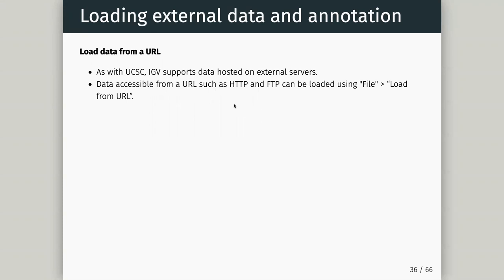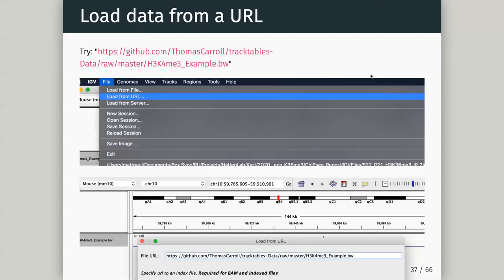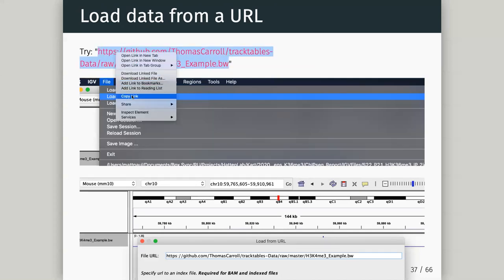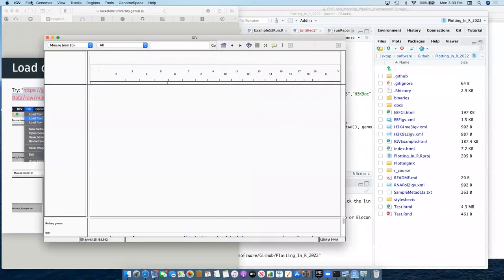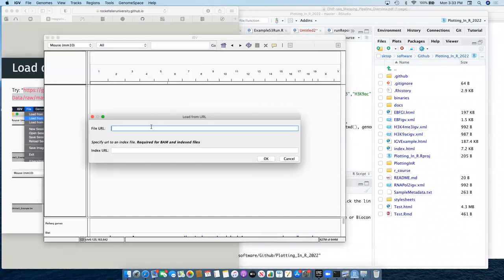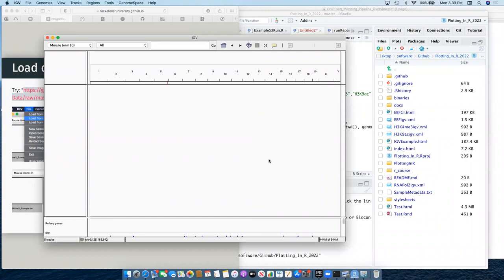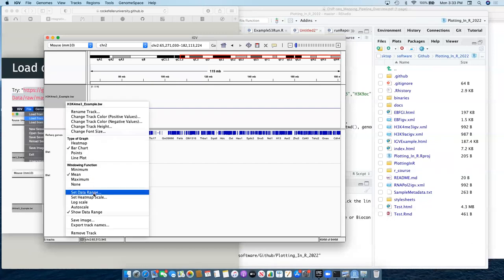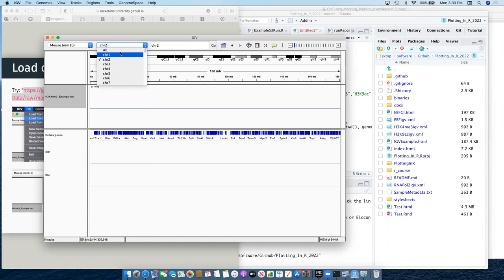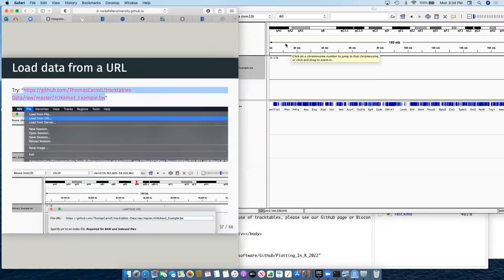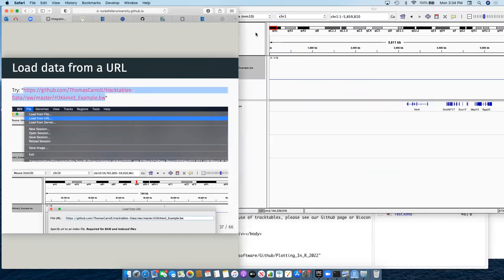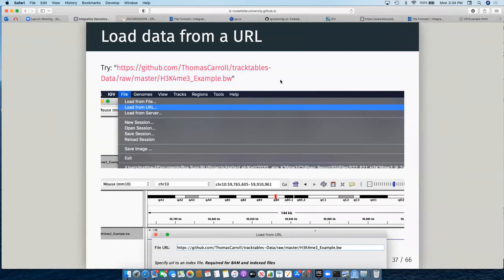You can also load data from a URL - we don't need the data on our computer. If we know a URL hosting the data, we can do something similar to UCSC. It just needs to be HTTP, HTTPS, or FTP - SFTP isn't supported. Just go to File > Load from URL, copy and paste the URL, and it loads.